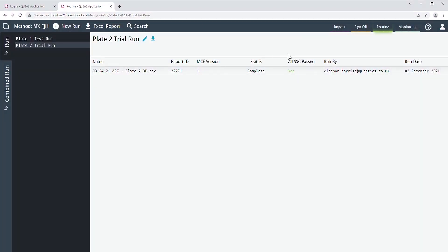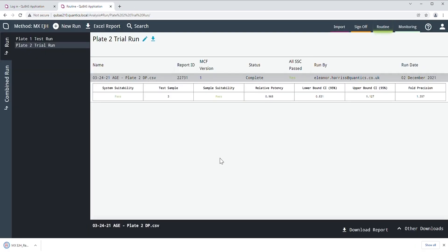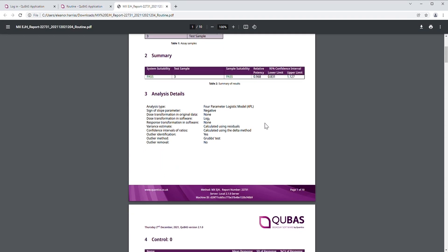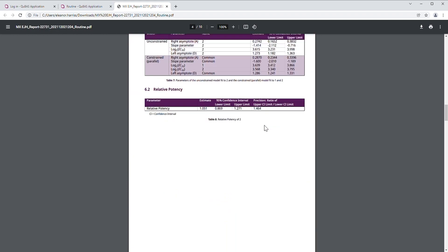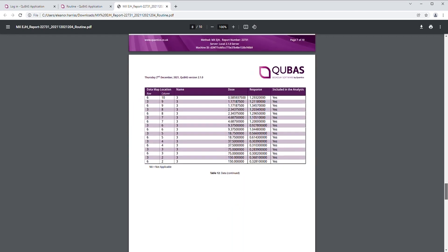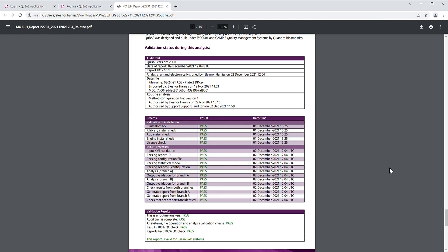In the Routine Room, once you've completed a run and your sample suitability criteria may have passed or failed, you can download the report at the bottom right hand side of the screen. That will automatically be a PDF and it will download and can be opened immediately to contain the audit trail, which is what's unique to the Routine Room.